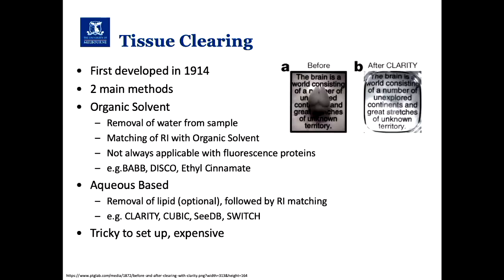The second method is aqueous-based methods, and these work slightly differently depending on the method that you're using. Something like CLARITY works by removing lipids out of the tissue, followed by refractive index matching.